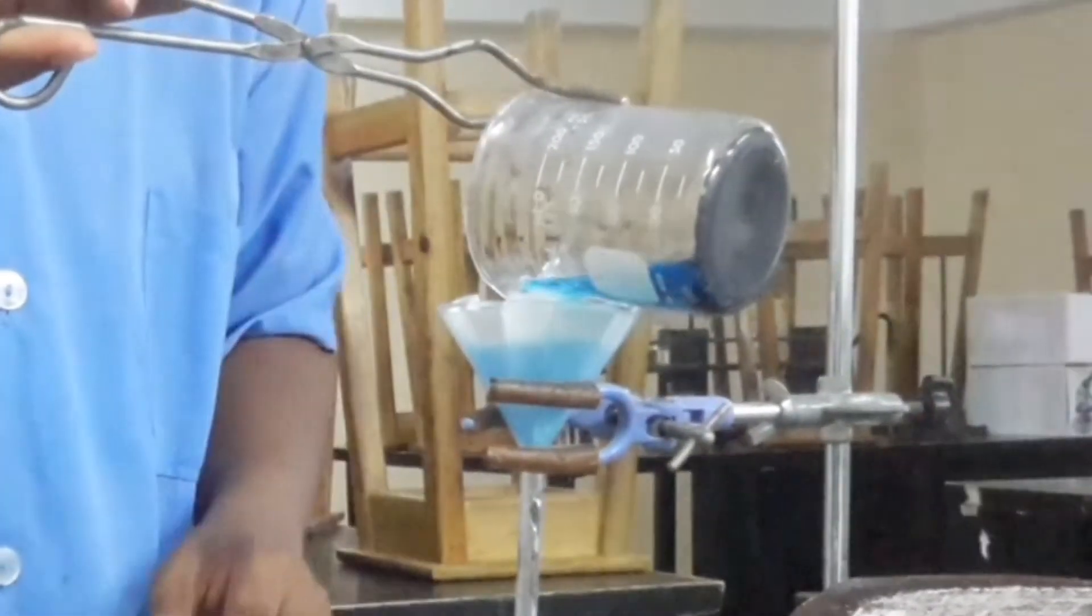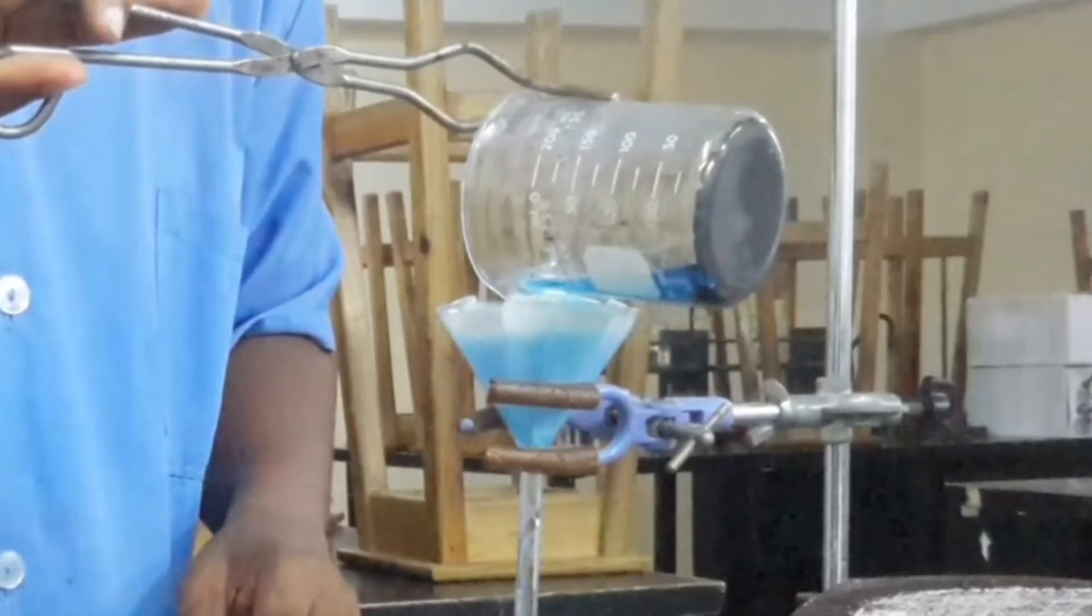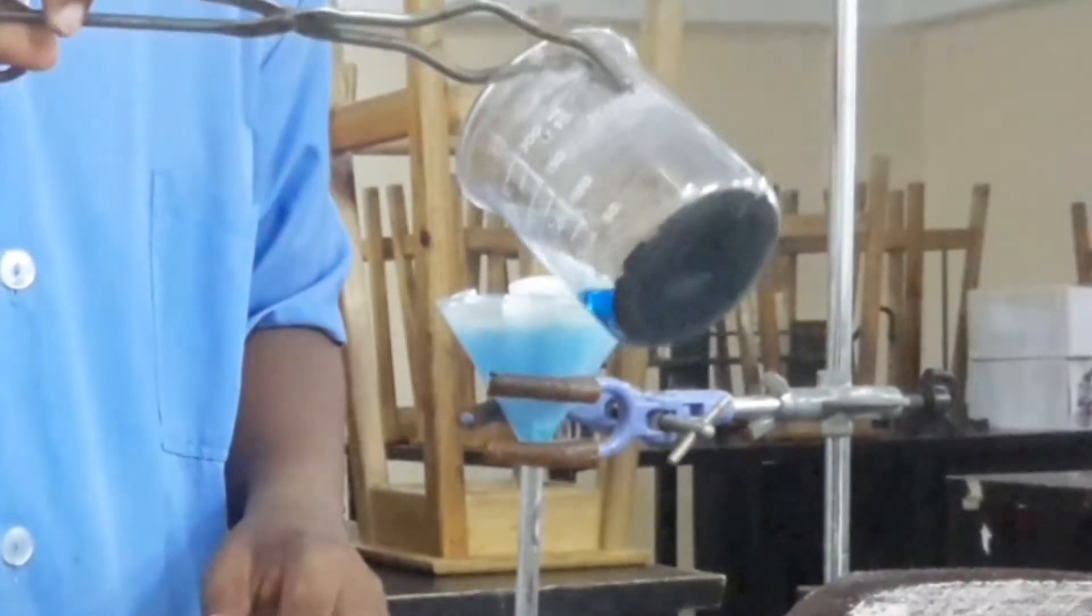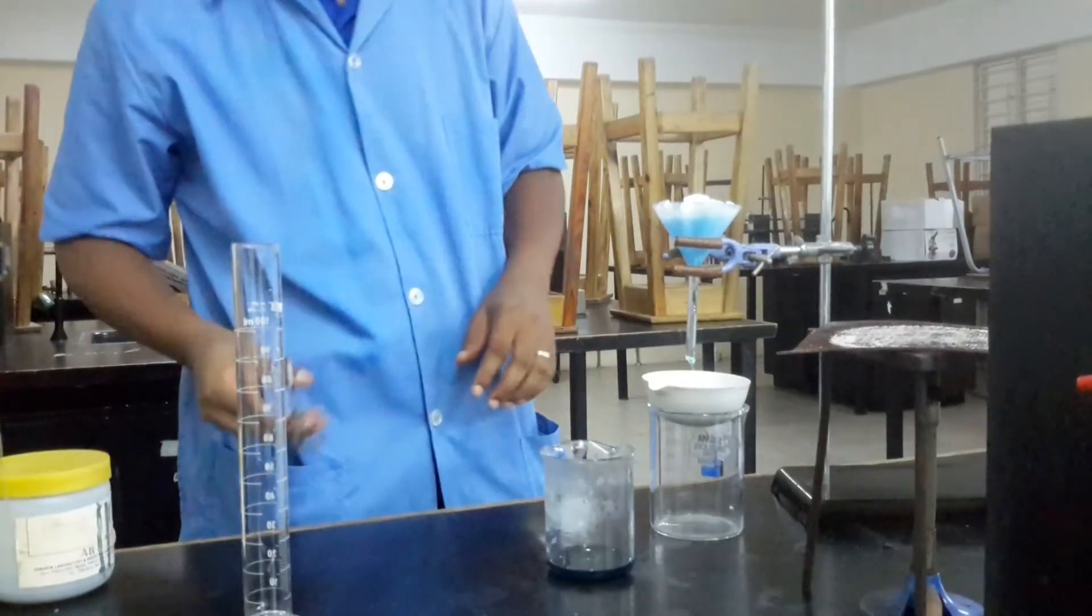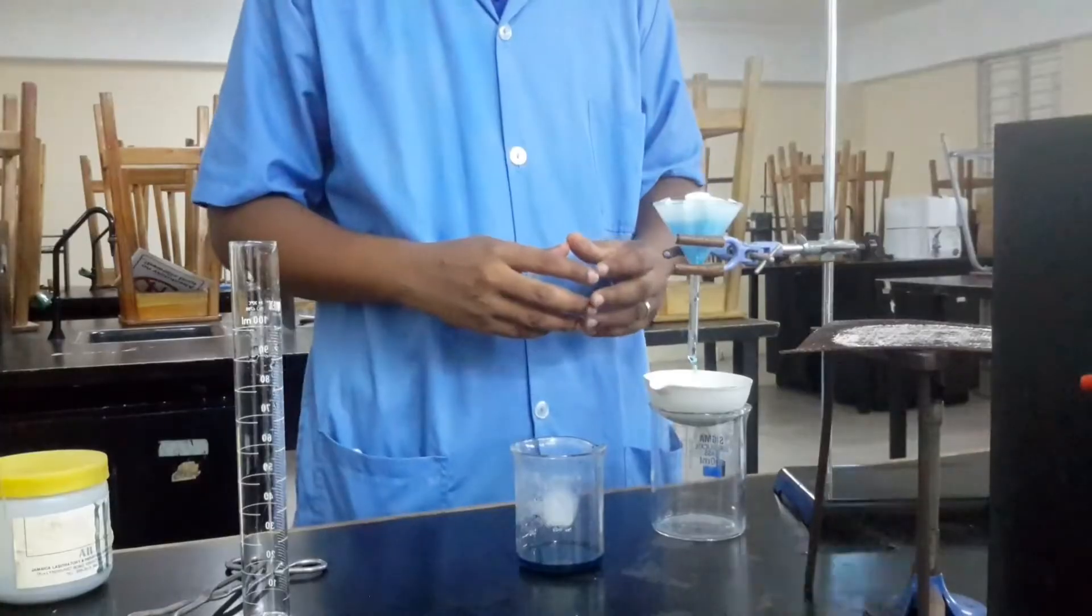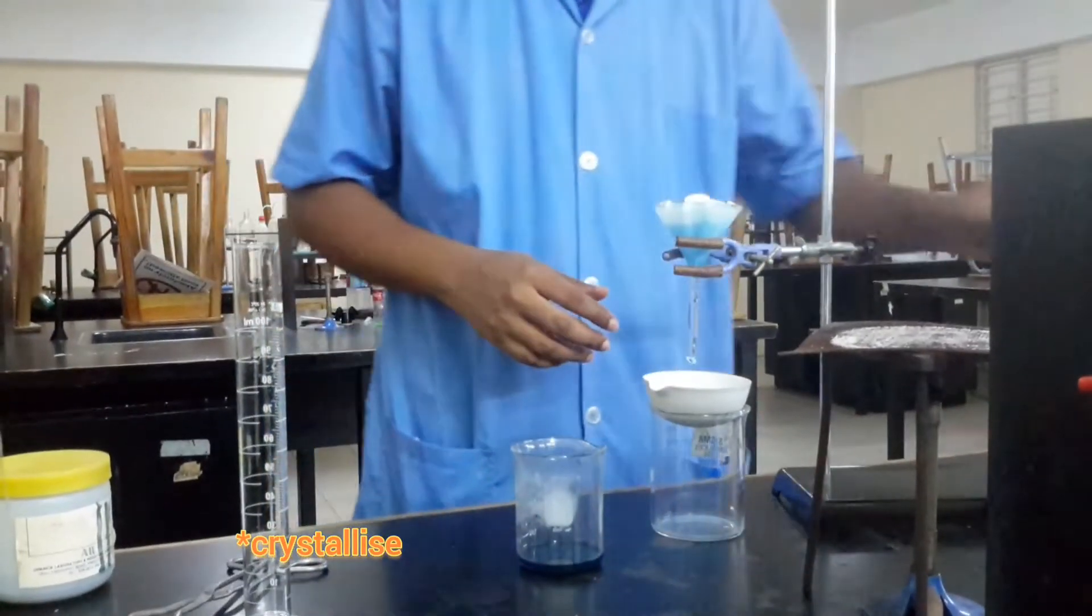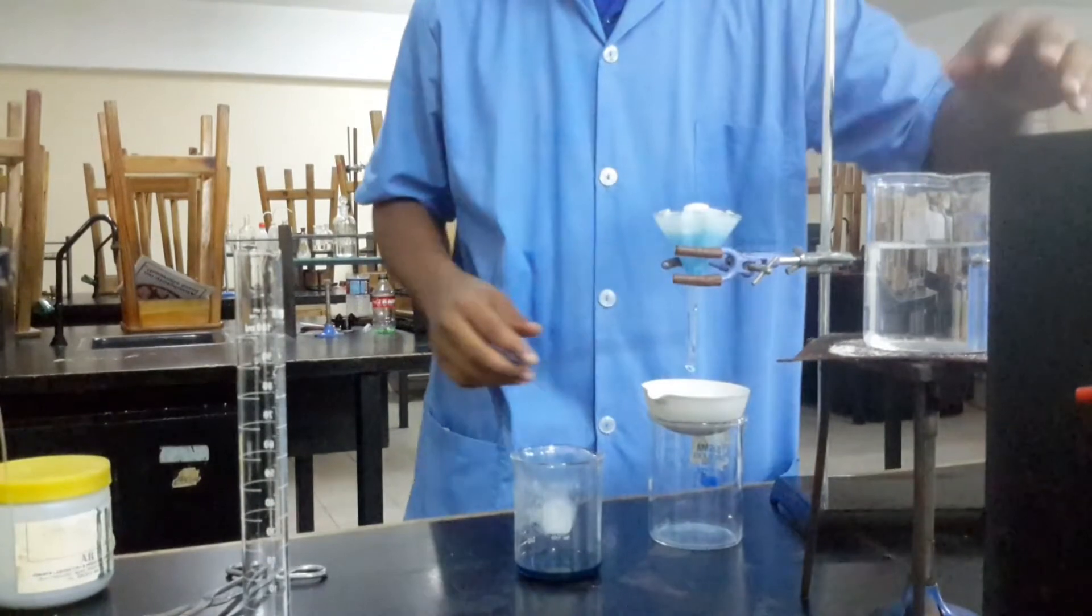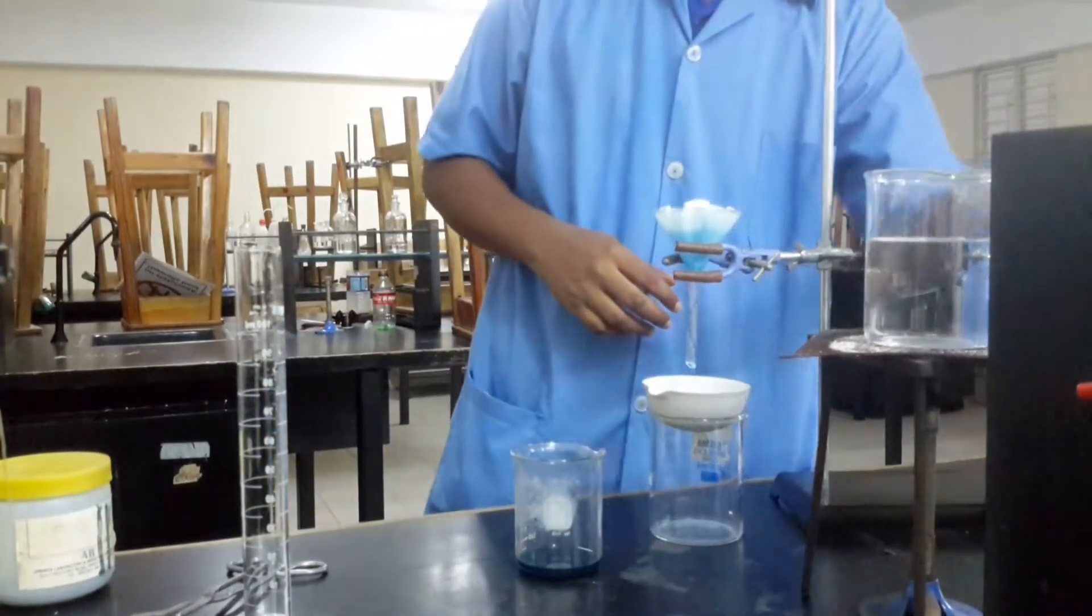We filter our mixture and we're having a blue solution coming out as the filtrate. Most of what would be the residue is in the bottom of this beaker. We'll just allow this to filter and then we will evaporate it.